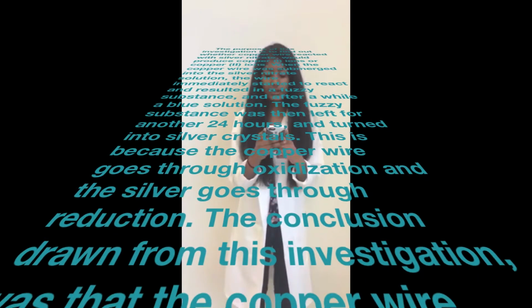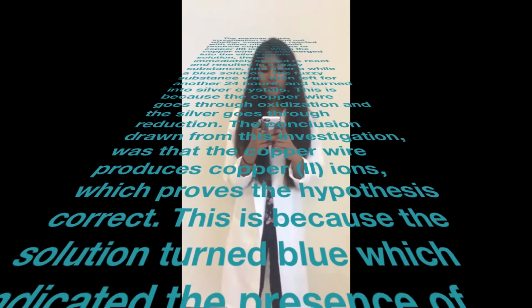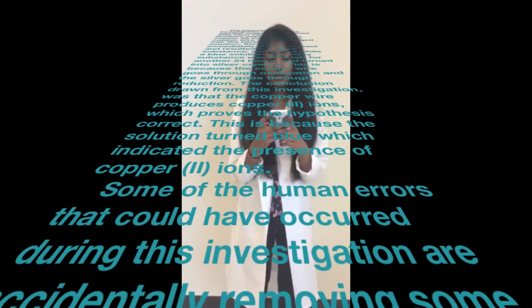This is because the copper wire goes through oxidation and silver goes through reduction. The conclusion drawn from this investigation was that copper wire produces copper 2 ions, which proves the hypothesis correct. This is because the solution turned blue, which indicated the presence of copper 2 ions.